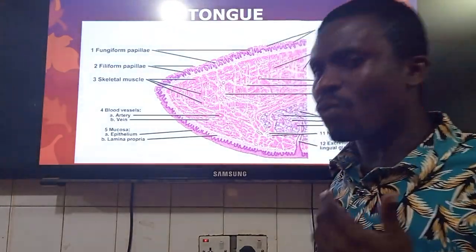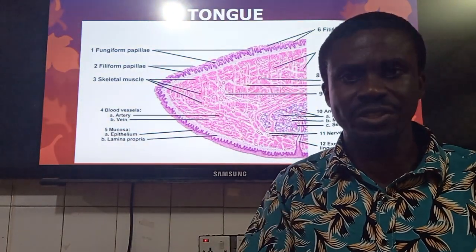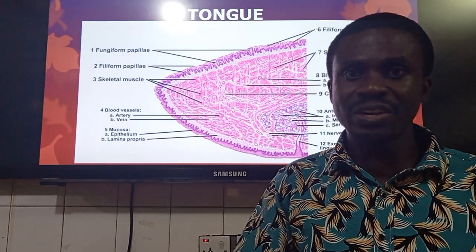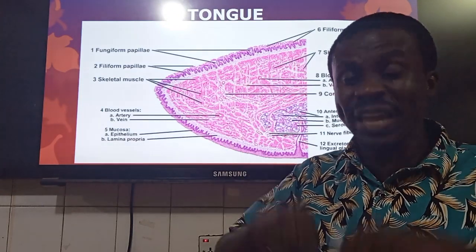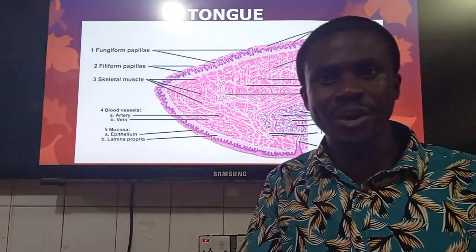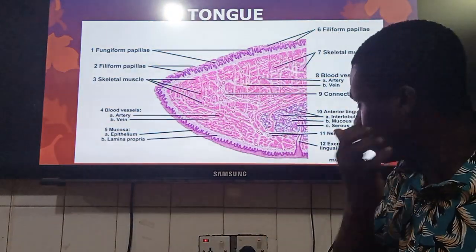So my friends, one question which oftentimes we are asked histologically is what is the single most histological identifying feature of the tongue? And my friends, your answer is the presence of skeletal muscle fibers running in different planes and interspersed within them, glands. And these glands, they could be serous, they could also be mucous. So that's the useful thing I want you to know over here.